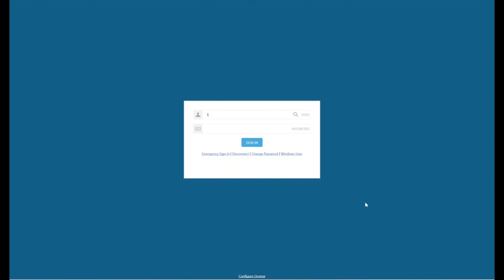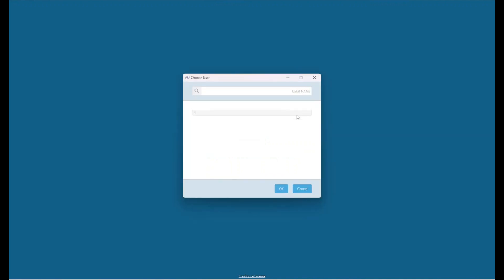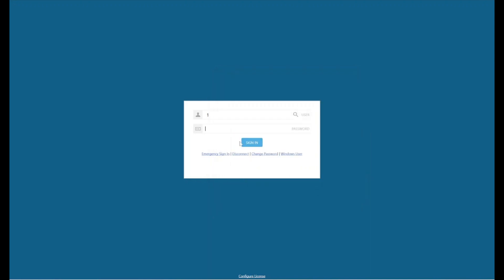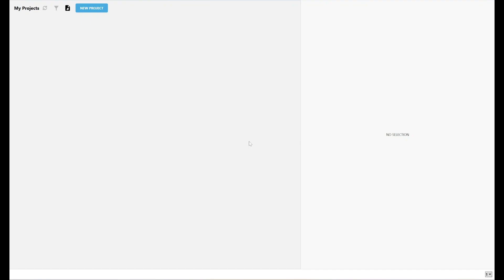I've got my username here, which I've just put in for demo purposes. I've also got a magnifying glass here within my username box. If I wanted to easily select the user, I can just click on it in the drop-down list and click OK. And then I've got my password field here. The password is obscured from anyone looking over your shoulder, so there is a measure of security there. I'm just going to sign in.